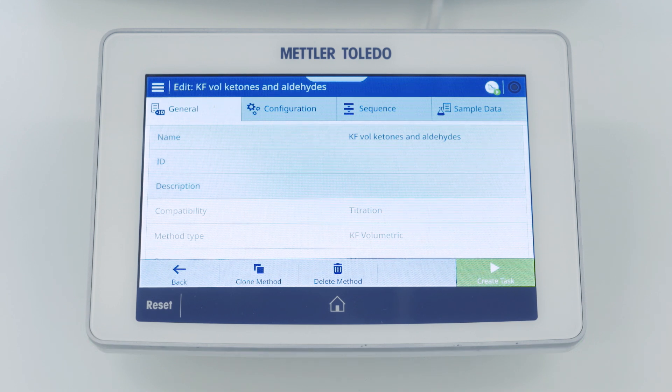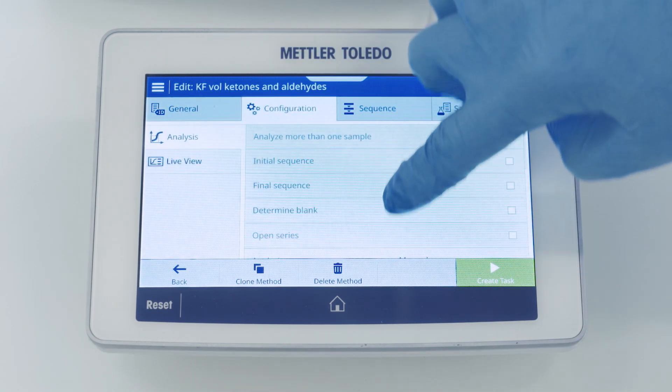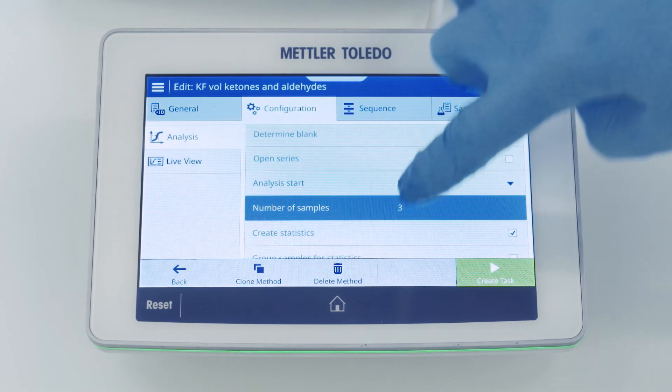The only thing that we're going to change is the number of samples that we are determining. For this demonstration we're only going to determine one sample.